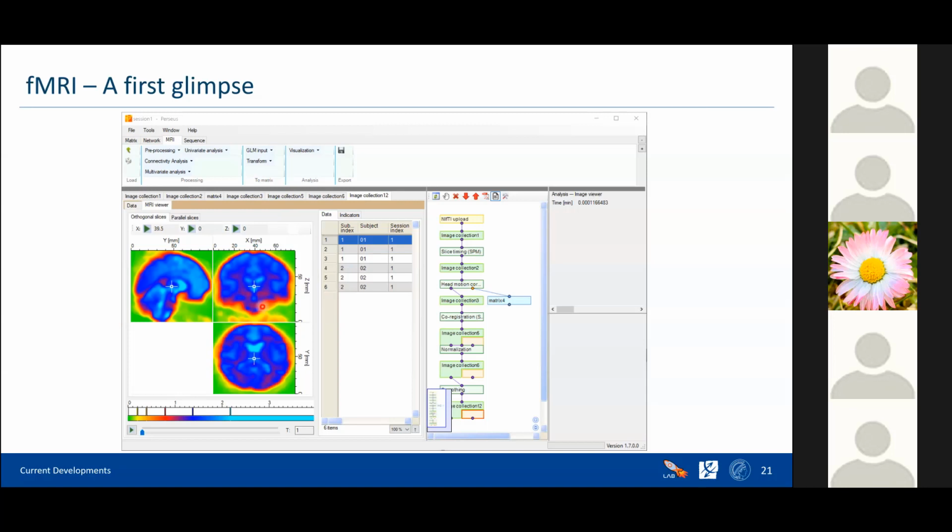And if you get some data from proteomics, from metabolomics, or whatever, you can just put them in another matrix, and then you can do some kind of cross correlation and so on. So I guess that will be very useful, hopefully, for this really nice and interesting community.